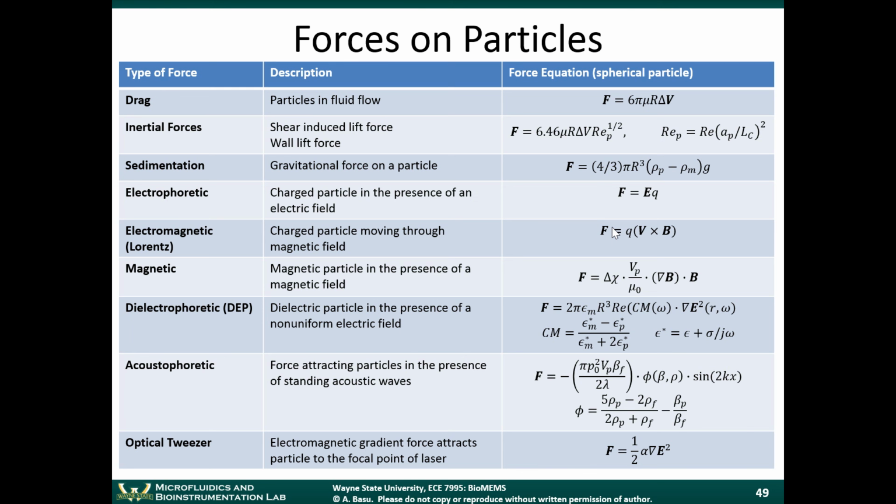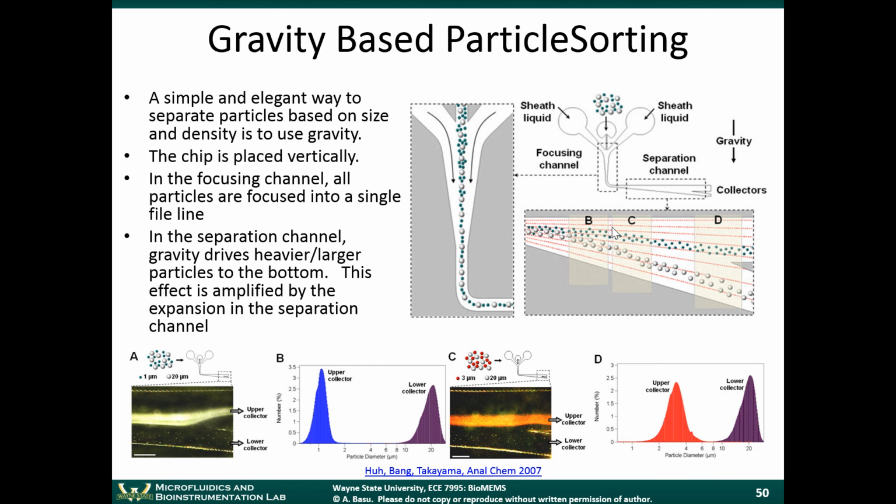And then you can also use optical techniques. Interestingly, you could use light to manipulate particles as well. Light is electromagnetic energy, and that electromagnetic energy can cause a particle to be deflected off in one direction or the other. So let's talk about some of those methods.